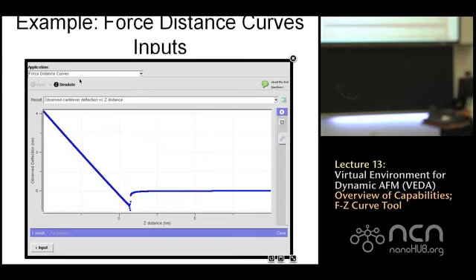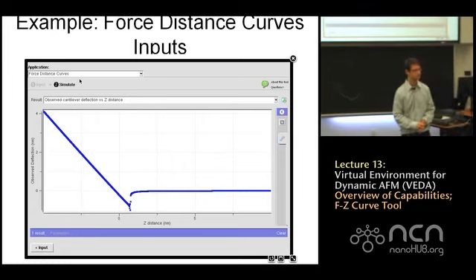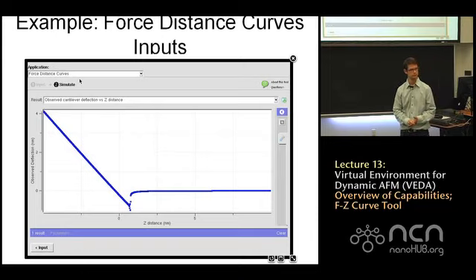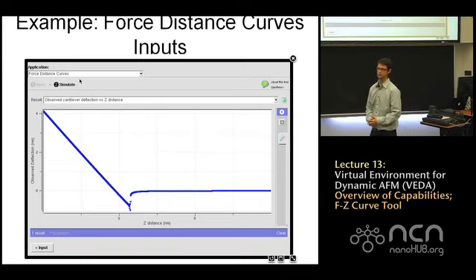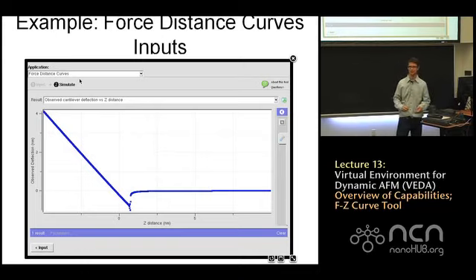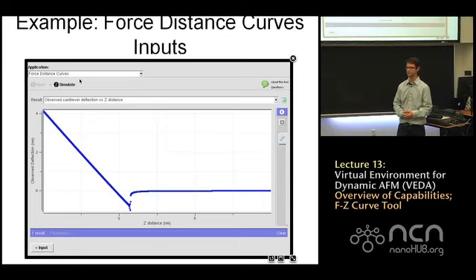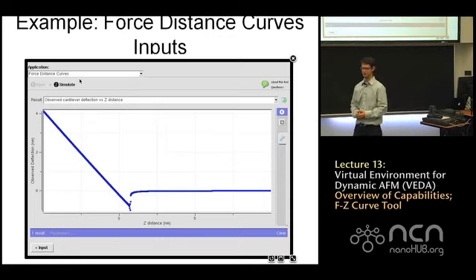So this helps you do some parameter studies where you can look to see, for a soft surface, what's the best cantilever and so on. And it helps you develop an intuition. One thing I should stress is that this is a nonlinear problem, so often that means non-intuitive. It helps if we just do simulations to see what kind of things we expect, and then when we do the experiments, we don't think that the machine is malfunctioning.